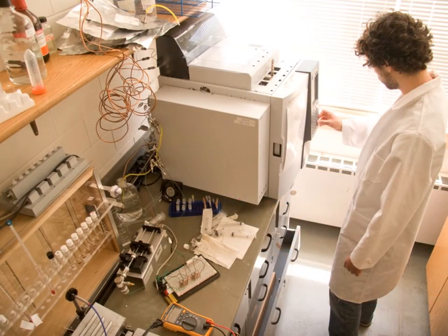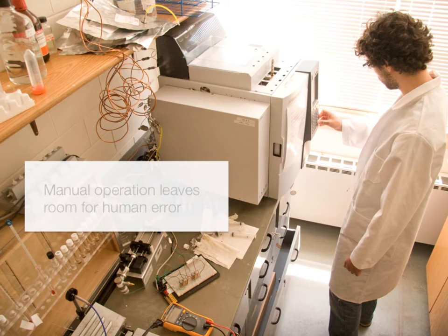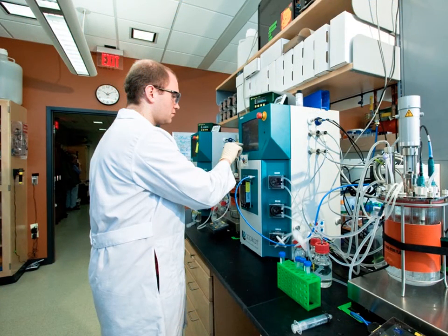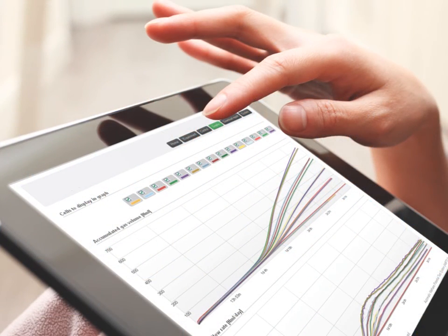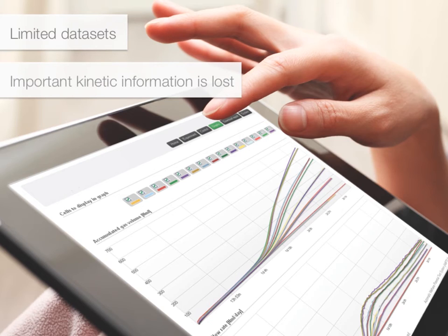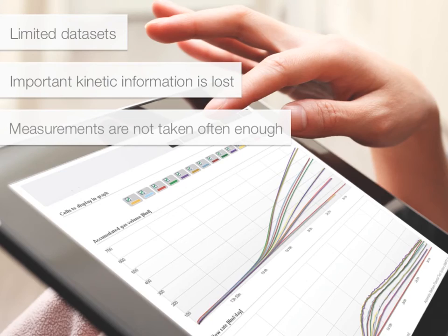Another issue is that most of these methods are manually operated, which leaves room for human error. In addition to this, measurements can only be taken when an operator is present. This leads to limited data sets in quality and quantity. There is also a high chance that important kinetic information about the degradation process is lost because measurements are not taken often enough at variable time intervals.